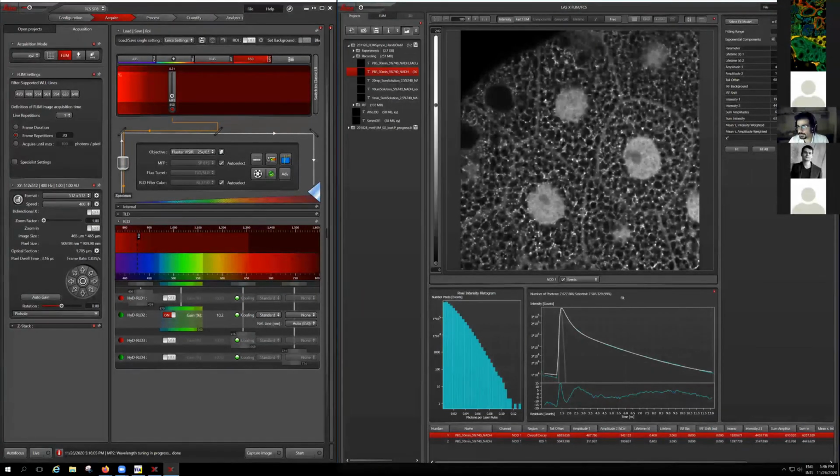Would the pulse shape of the laser have an impact on the measurement in case it changes over time? Gerhard, that's a very, very important question. I hope that the shape of the pulse is not changing over time. So I always switch on the system hours before I do the measurements to make sure that the infrared laser is stable. And I hope it's not varying, at least the shape of the pulse is not varying over time.